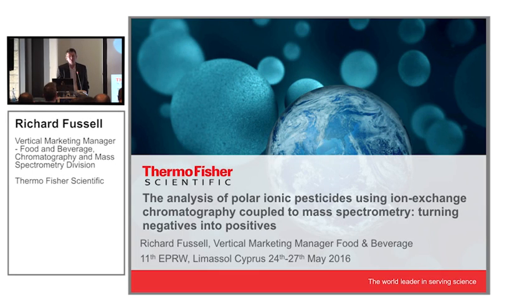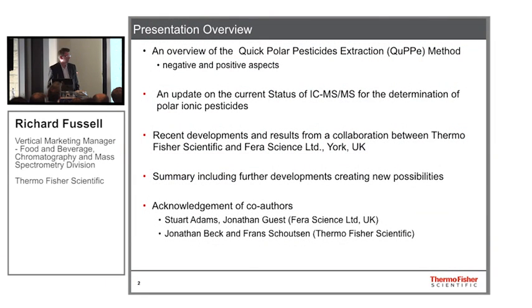And I'm going to talk a little bit about ion chromatography and mass spectrometry. So I've been a big fan of ion chromatography for a long time. In fact, it was the first chromatography system that I ever built, in about 1982 or something like that. So I've been doing ion chromatography for longer than I really care to remember. But now we have an opportunity to use some really nice, sophisticated systems in combination with mass spectrometry.